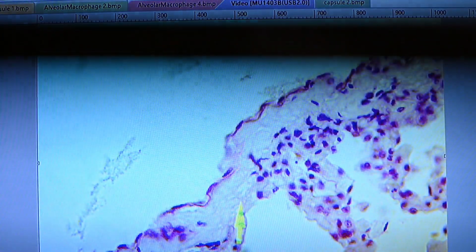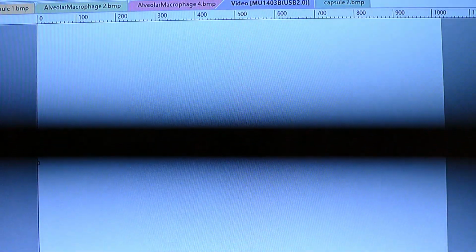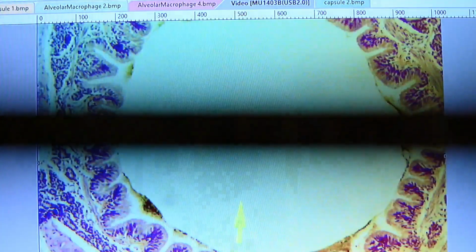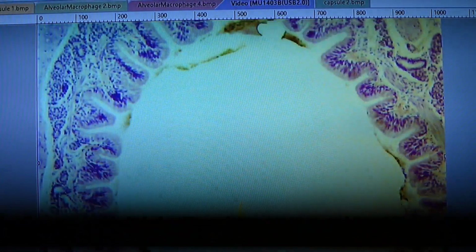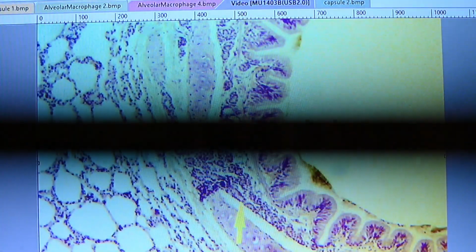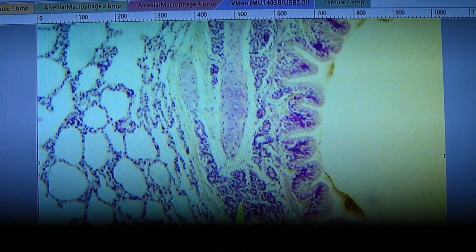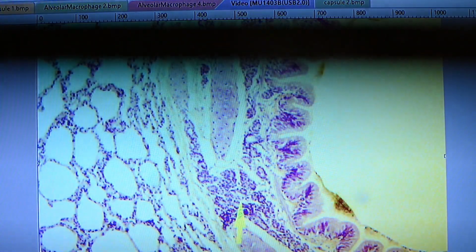Now we're going to go look for a bronchus, and here's a bronchus. Okay, here's a lung bronchus. You can see the wall is somewhat folded around the edges. Still has a pseudostratified columnar epithelium around here. I see some glands in this area here, number of glands, mostly serous glands. You don't see many of the mucus shapes once you get down into the lung like this.